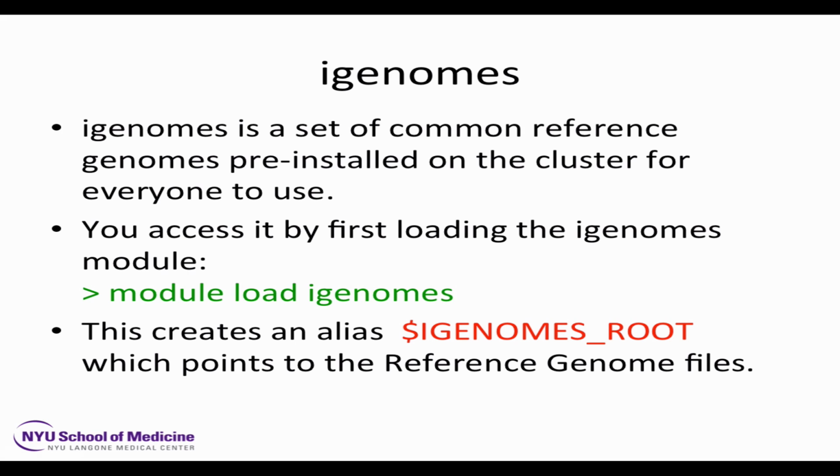And obviously that is specific to what build or version of the genome you're using. HG19, HG18, whatever they call it now, GRCh38, or mouse, MM9, MM8, etc.